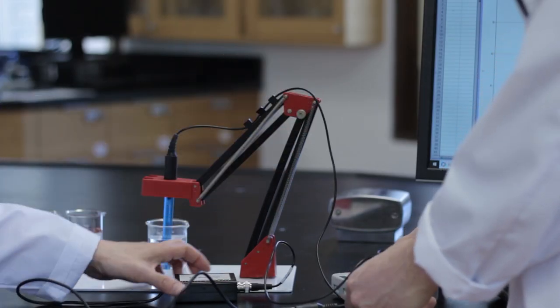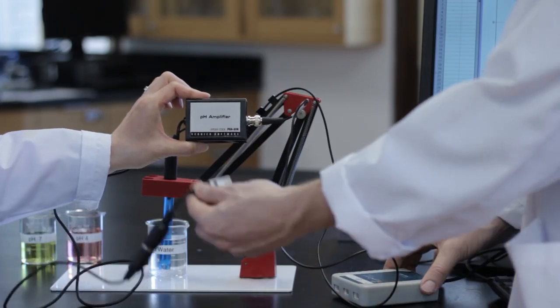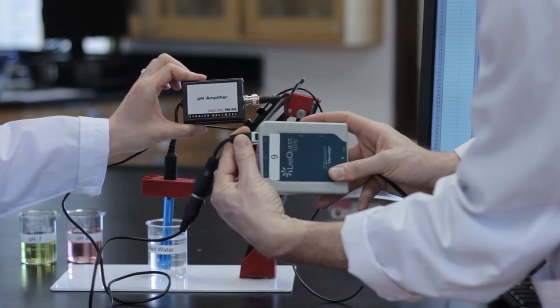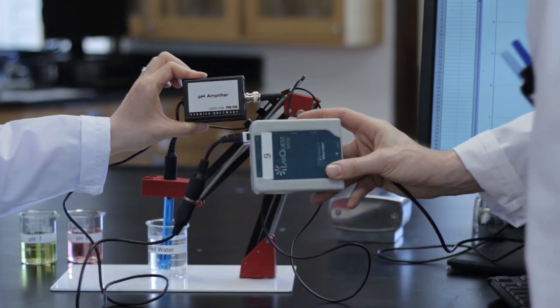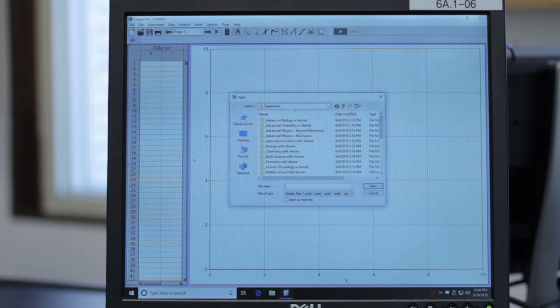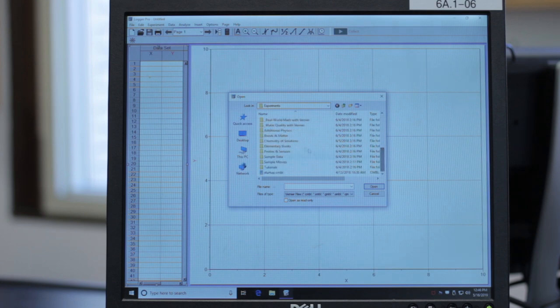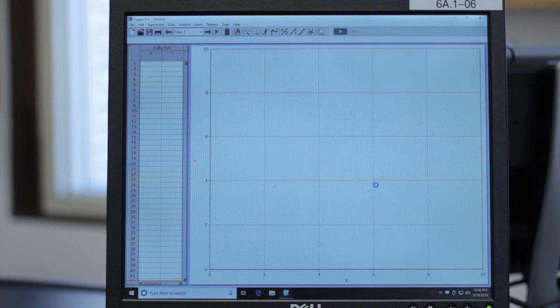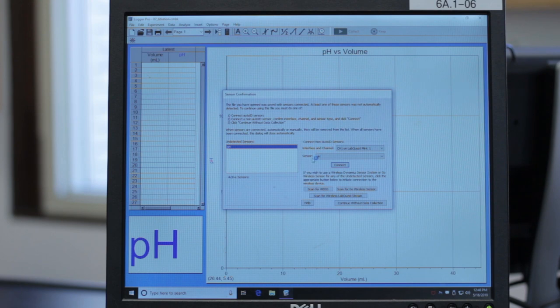You now have to set up LoggerPro. Make sure the pH sensor is attached to the LabQuest Mini interface with the green LED light on. Open the LoggerPro program and select the desired file for the experiment. If prompted, make sure the selected sensor is pH and click connect.